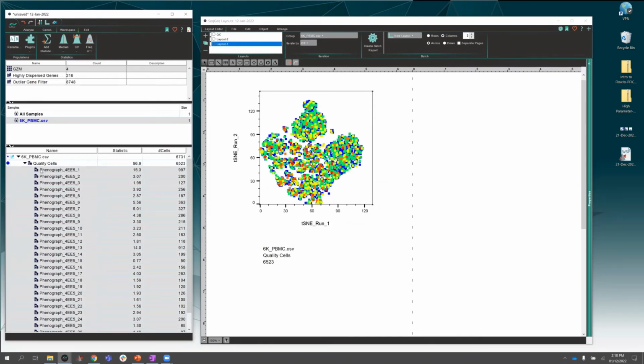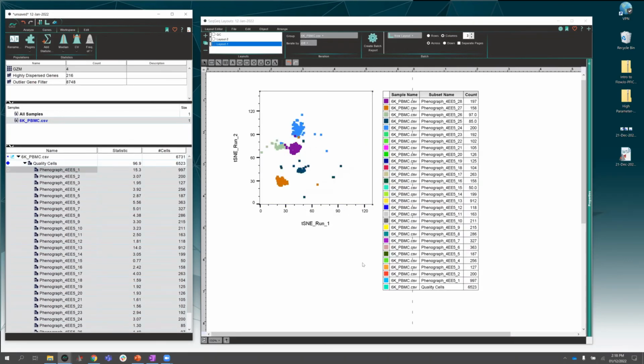So if I just select my clusters, drag them right onto my t-SNE plot, right? It's probably going to take a second to populate because that's a lot of data, but you can see that I can visualize now all of my clusters together on the same dimensionally reduced space, right? My eye is going over to this yellow cluster because if you recall, that's where I saw a lot of granzyme, right? So maybe I'm getting clues that this island is going to be some kind of a cytolytic cell, or some kind of an activated cell, right? So maybe I'd want to focus in on that yellow cluster, right? Two shades of yellow here, but it looks like it's maybe cluster number 13.